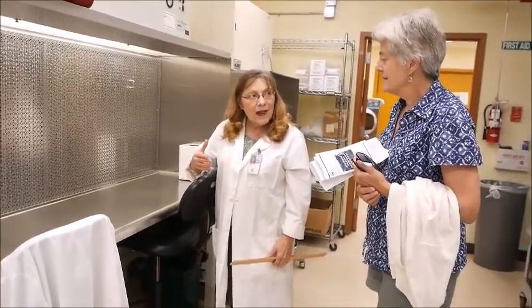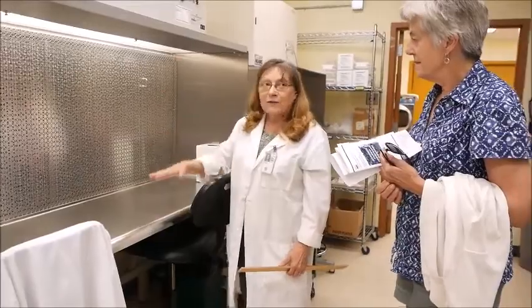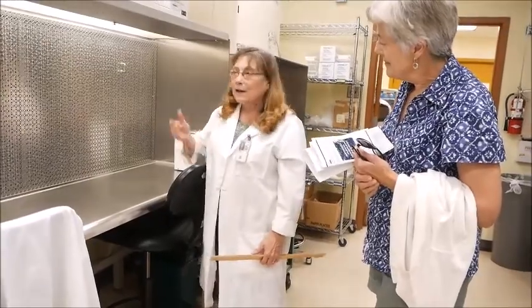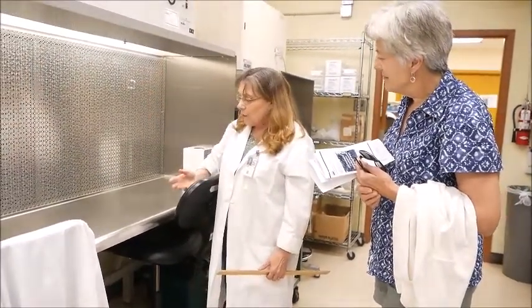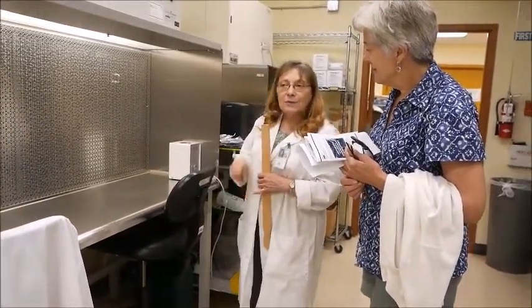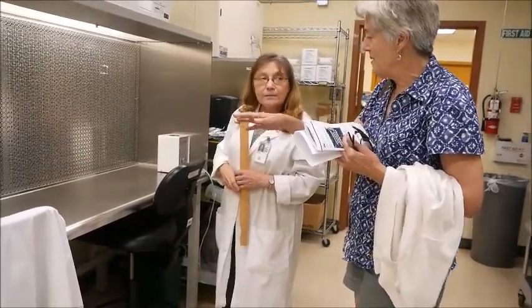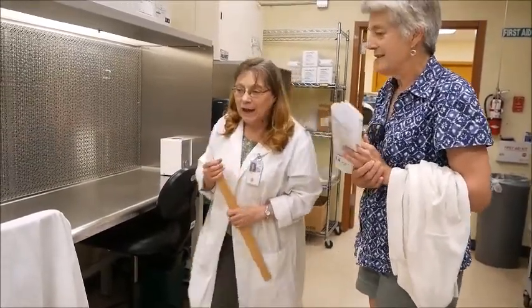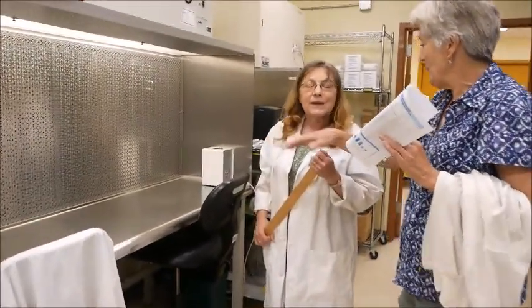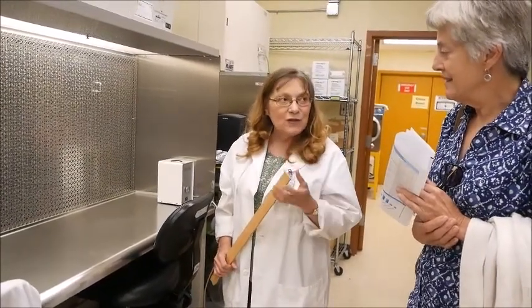So if you come to work in the lab, the first thing I teach you is how to work with the sterile field. You have two forces: gravity — we still believe in it here for science — and the force of the airflow. So if you had a fungal spore, it would fall this way. You work with your hands back here, with all sterile equipment, sterile media, sterile tubes, tools. You get the wiper surface down, you keep your surface sterile. We have autoclave-sterilized working surfaces, and you put them down like a table block. And so you maintain your sterility that way.